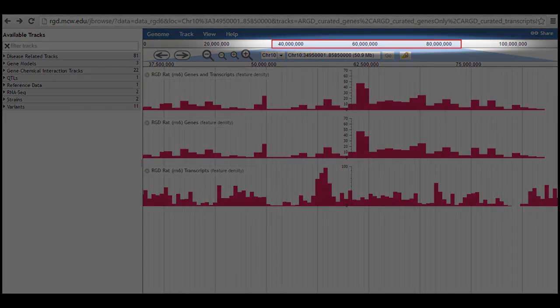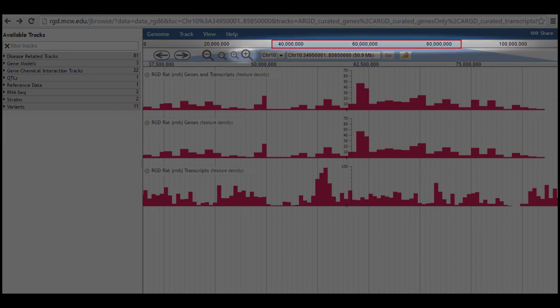From this view, you can click and drag a similar area on either number bar or use the plus magnifying glass icons to zoom in.